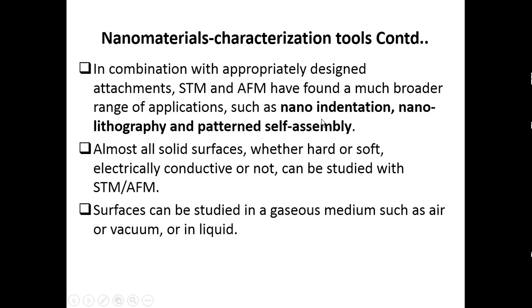So, what is meant by nano indentation? Nano indentation is also another method of testing the nanostructures for knowing the material properties or structural properties of the material, and that is actually done with the resolution on atomic scale. Okay, so that is what is called nano indentation.